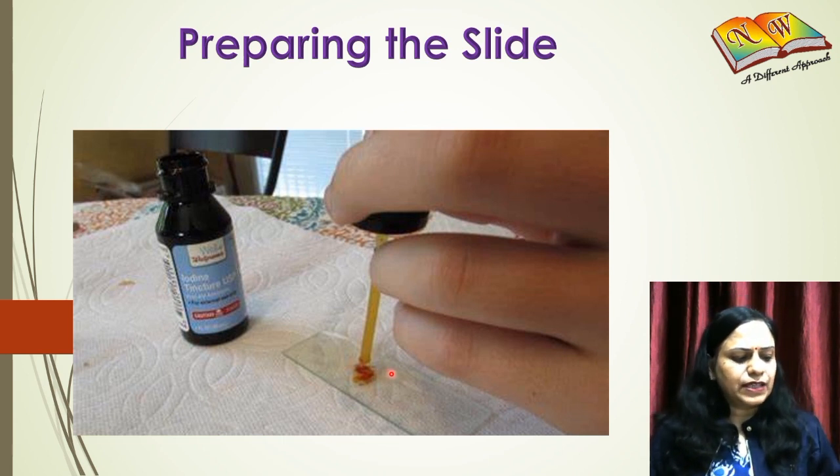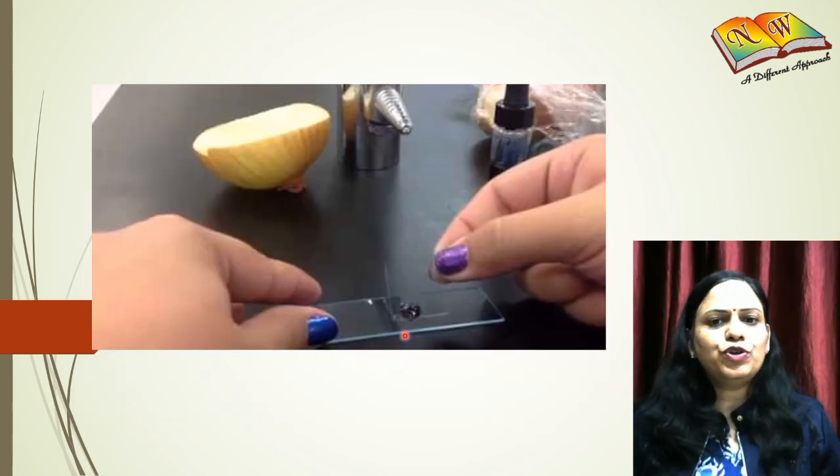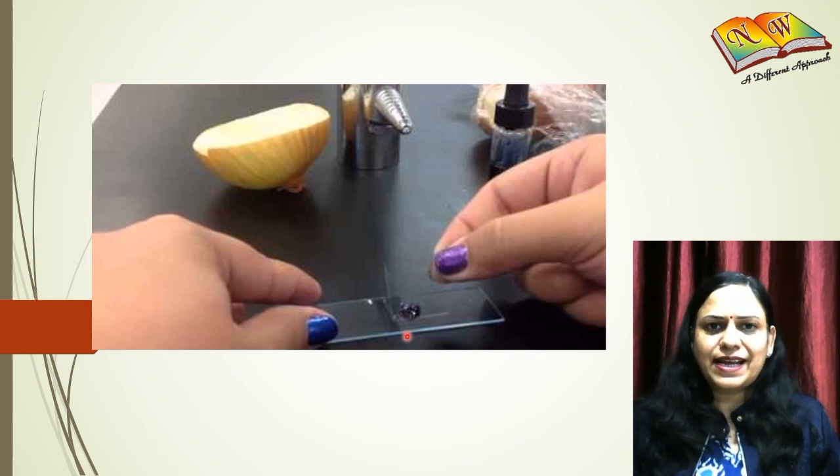Then add a drop of stain — that is iodine solution — to the slide, and then very gently place a cover slip on it. Please ensure that while placing the cover slip, no air bubbles are trapped on the slide. After this, you are ready to observe the slide under a microscope.